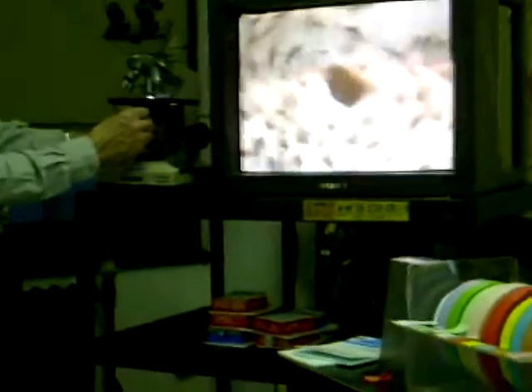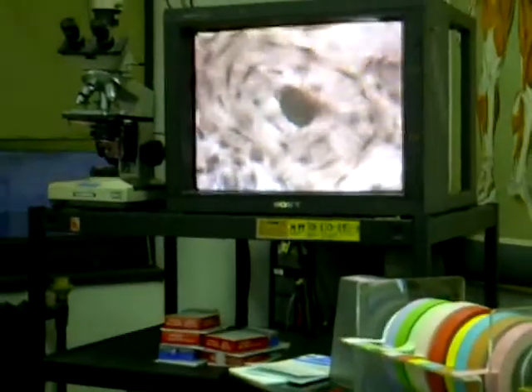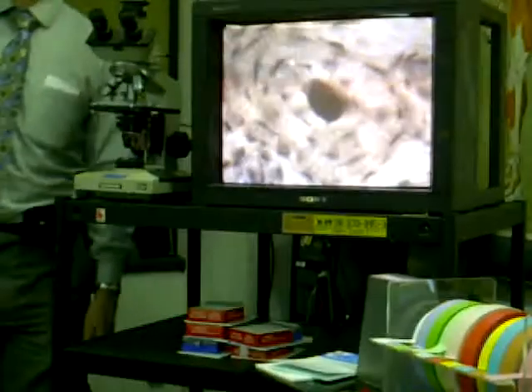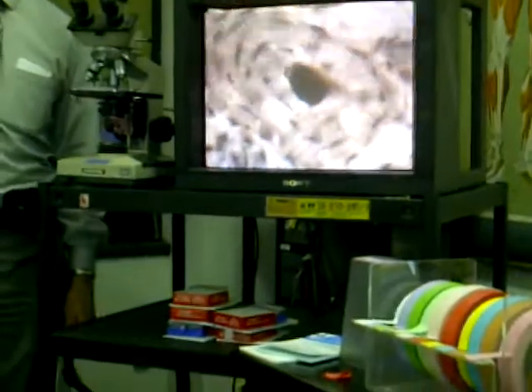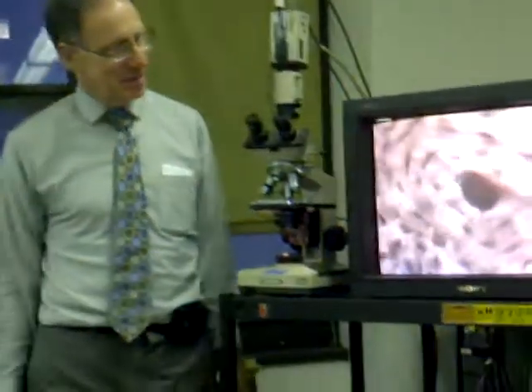The structure that fills most of the field is called what? What is this a picture of? Osteon. An osteon. Okay, credit for that question. You'll see all these on the practical. If you add up the number of slides, they'll all be there.